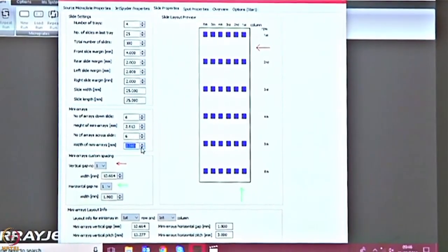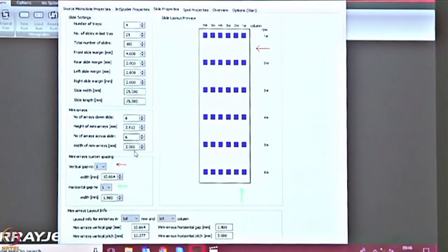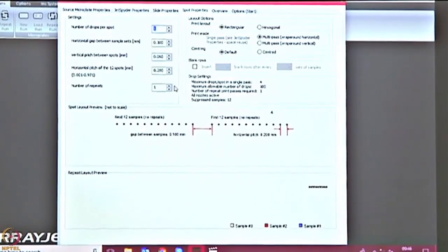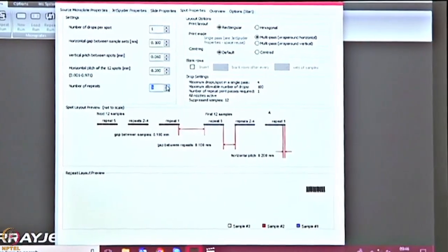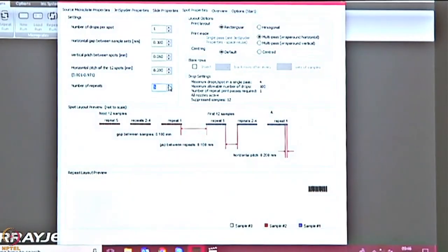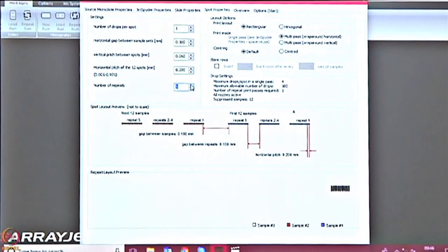So you can multiplex it. Right now I have given it several squares. And I can duplicate it. So most of the work in proteome is, obviously you want to get high reproducibility, so you duplicate, you triplicate it. So the HuPro is about duplication. So you've got 19,000 times 2 features. I can triplicate, so this is how it looks.